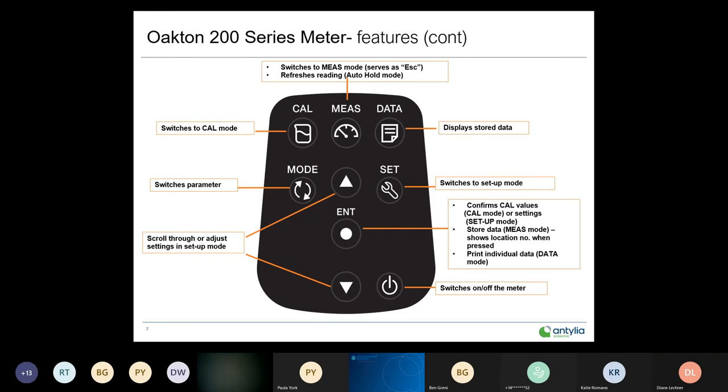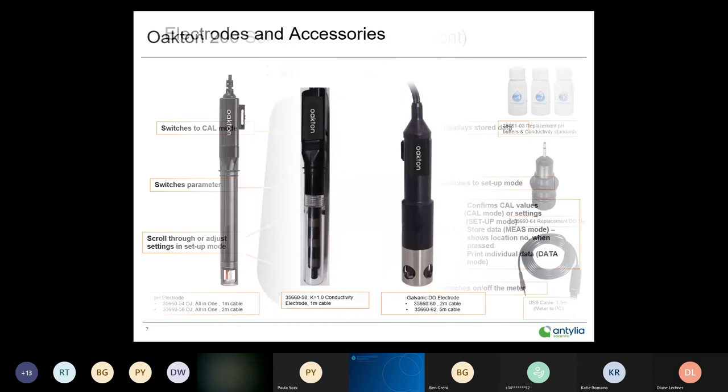The keypad on this instrument has nine buttons, very intuitive and easy to use. On/off button in the lower right corner. Moving across the top: separate calibration button, measurement mode button (also acts as an escape key in calibration), data button, setup button, mode button, and the enter button — which confirms calibration values or settings made in setup mode, and is also used for storing data.